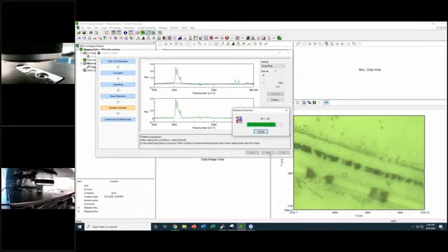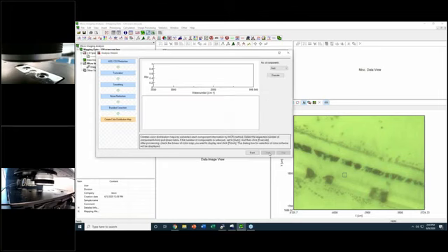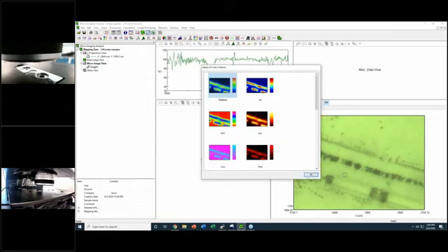Instead of looking into the peak height of a specific functional group, we are looking into the whole spectrum wave range, also in the whole image. So with all the information, the model is extracting the principal components of these measurements, and based on that we create the image.